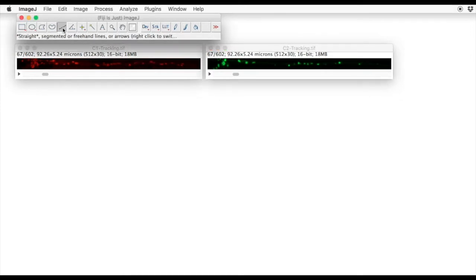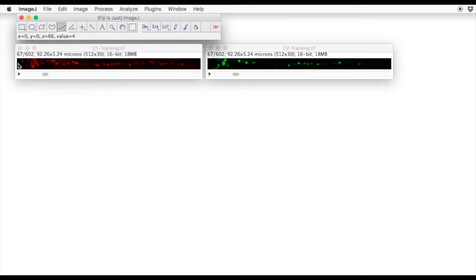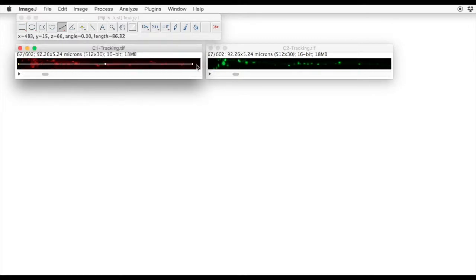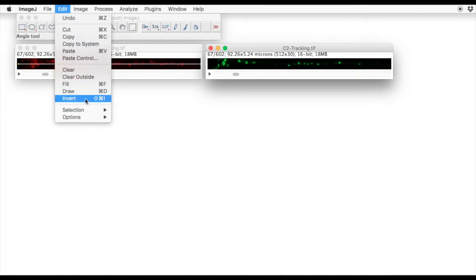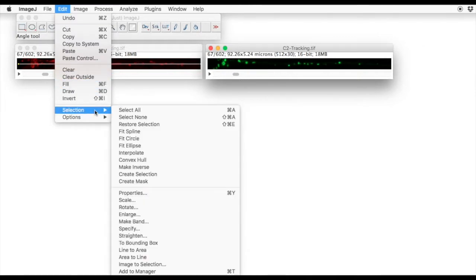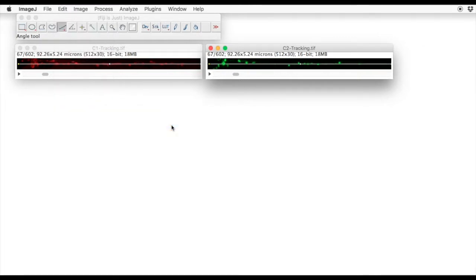So select the first channel, draw a line region of interest, and then we need to restore that selection. Edit selection, restore selection onto the other channel.